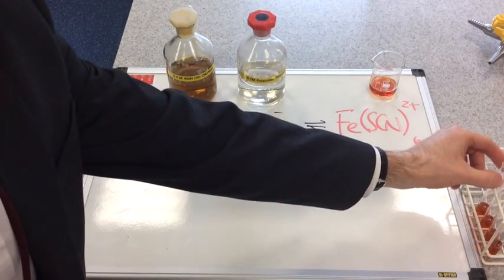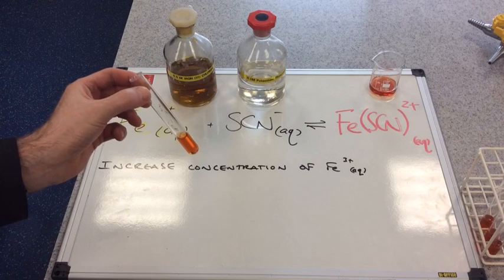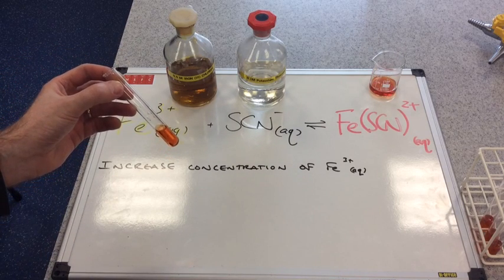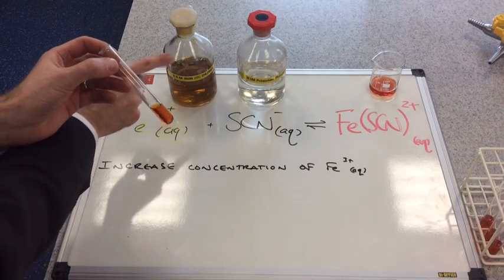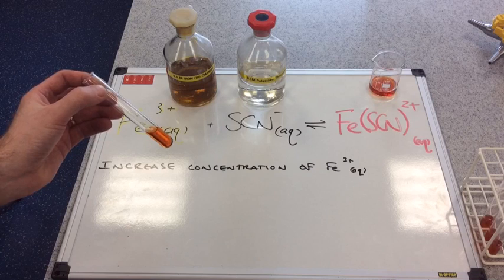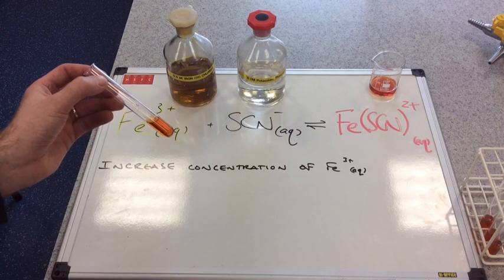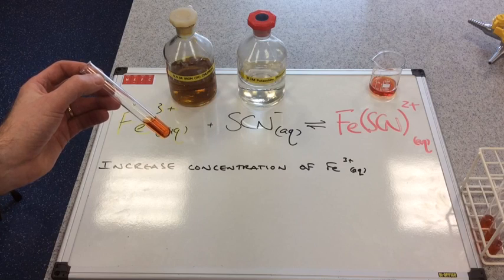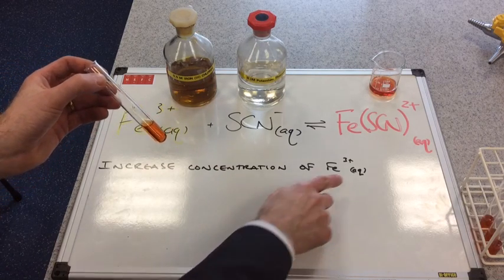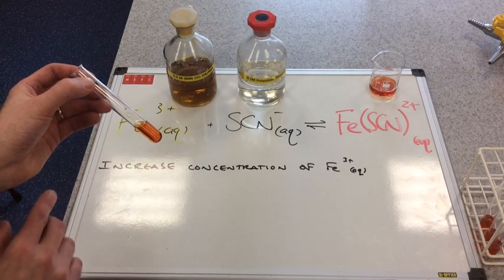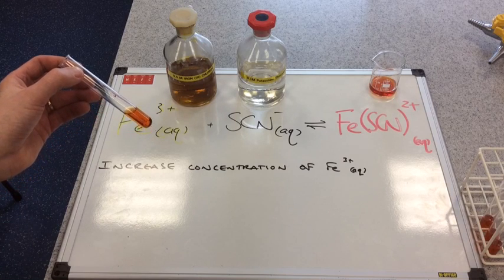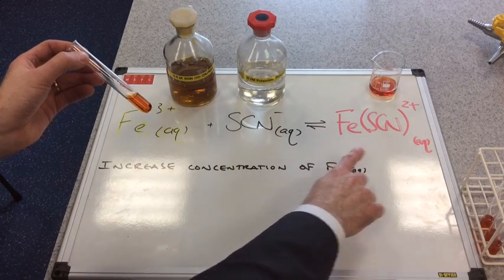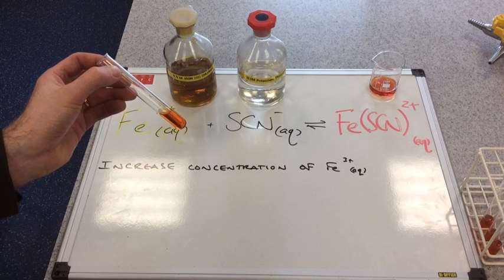The first experiment I'm going to do is I'm going to take one of my four remaining test tubes. Remember one's been put to one side as a control. And I'm going to increase the concentration of the iron 3 plus ions by adding a drop of this. So we've studied Le Chatelier's principle. And remember Le Chatelier's principle states that when you have a dynamic equilibrium and it's subject to a change, so I'm going to change the concentration of the iron 3 plus ion first, it will respond to minimize the change. So how do equilibria respond? They move. It will either move forwards or it will move in the reverse direction to try and counteract the change that you've imposed.